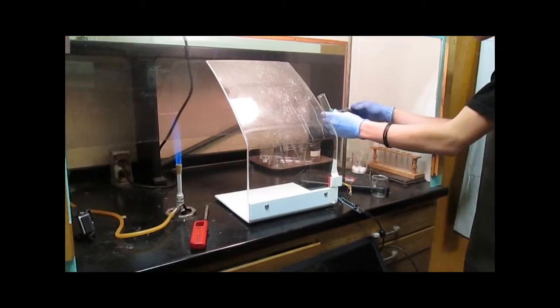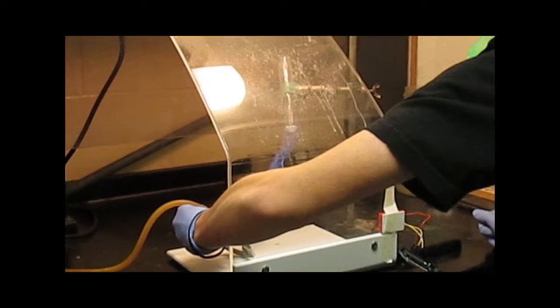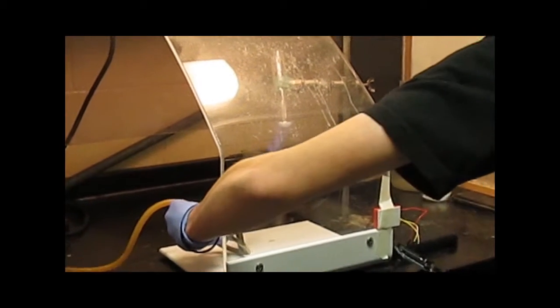Now what we're going to do is heat up the potassium chlorate with the Bunsen burner until it's in its molten state. That turns the potassium chlorate from a fine white powder into a cloudy liquid, and at that point it's ready to react quite vigorously with the gummy bear.